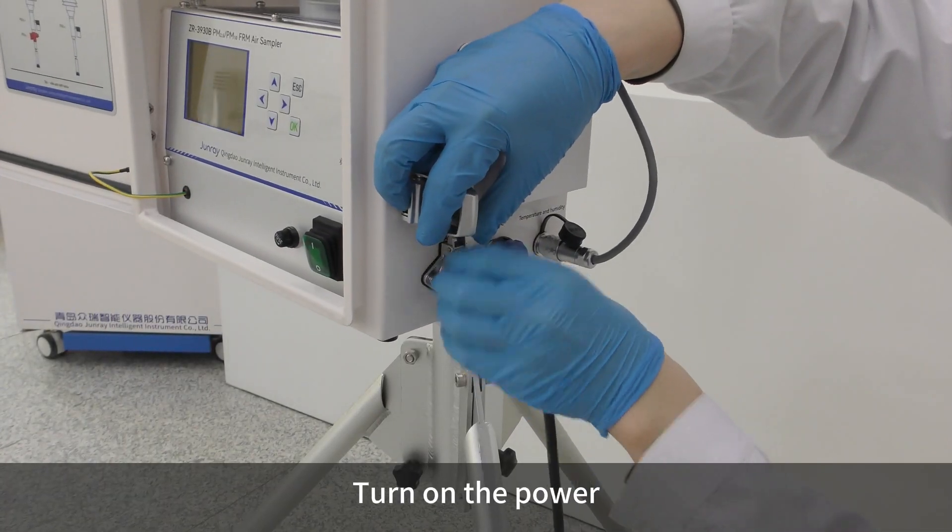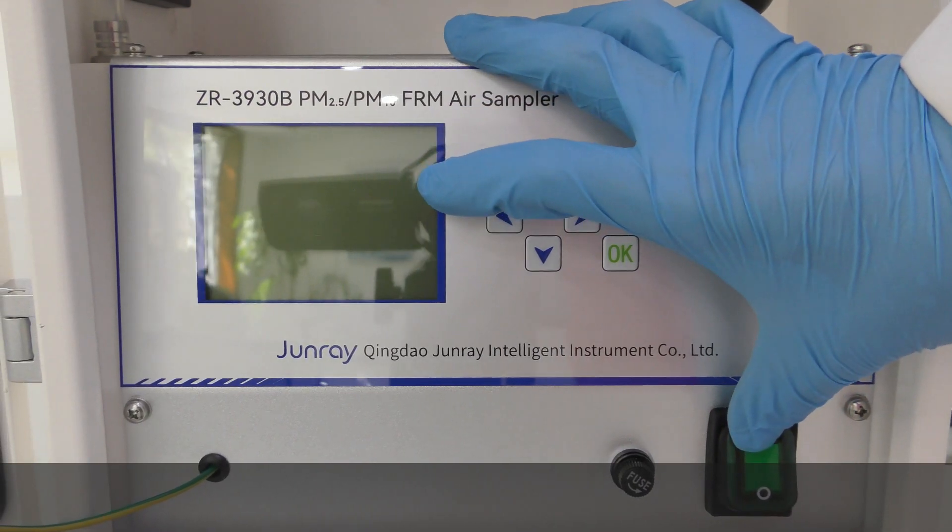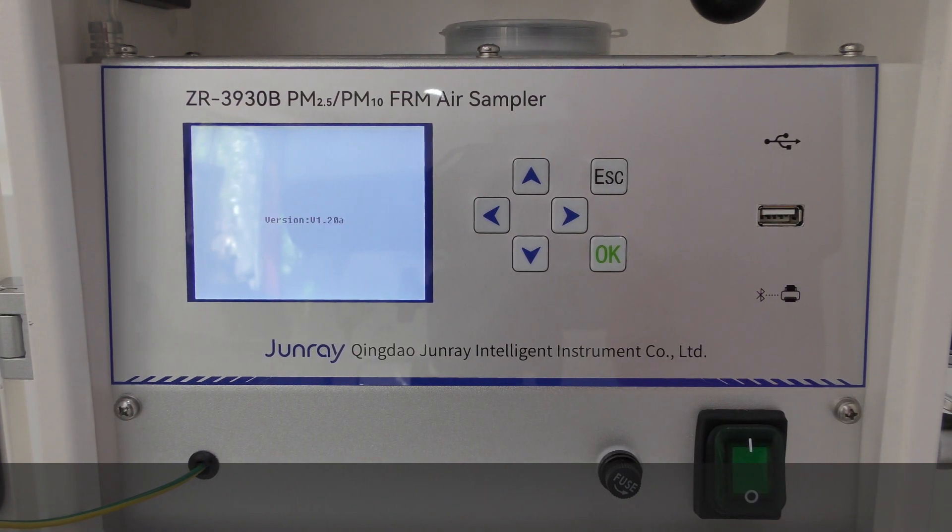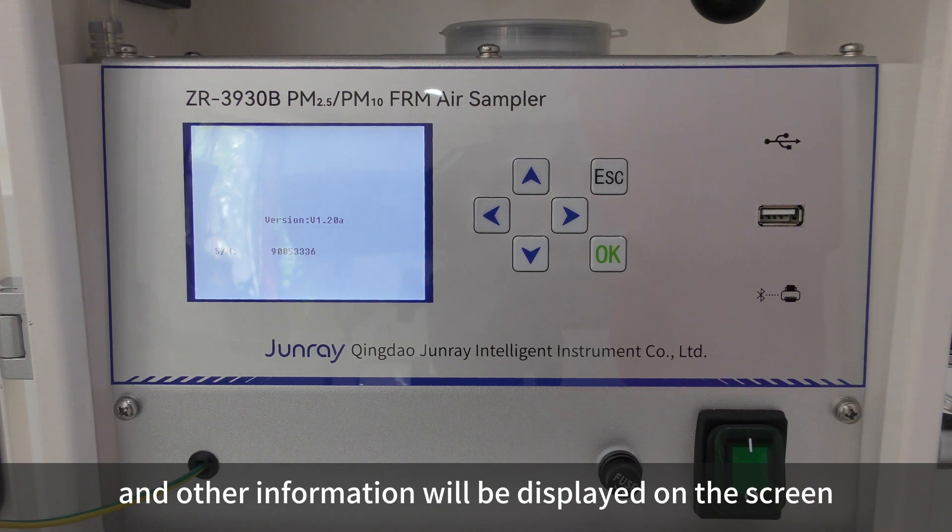Turn on the power and the version number, instrument number, and other information will be displayed on the screen.